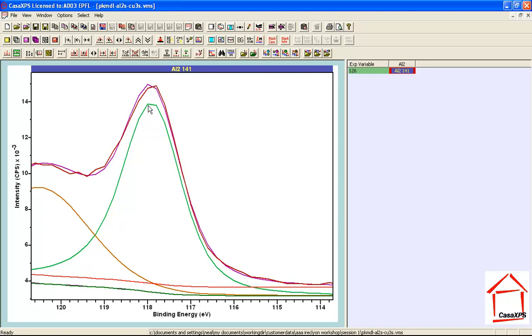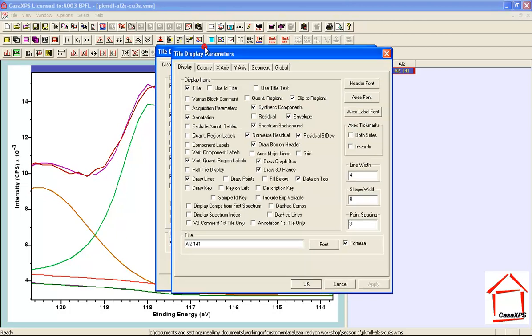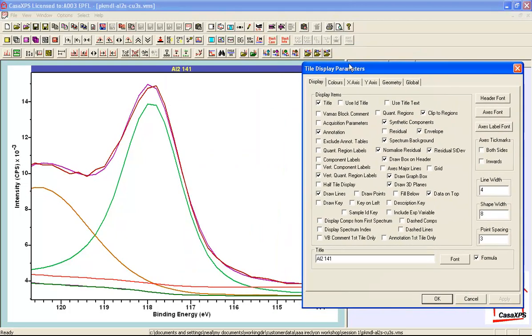Now what this does is it shows you the relationship between the points in the curve and the points in the data which are fitted in a least squares sense. However, for display purposes what we would like to do is adjust the display of these components so they reflect the true smooth nature of these synthetic curves.